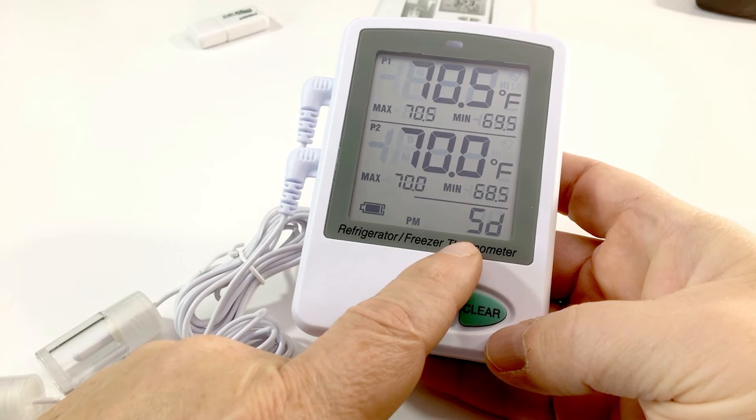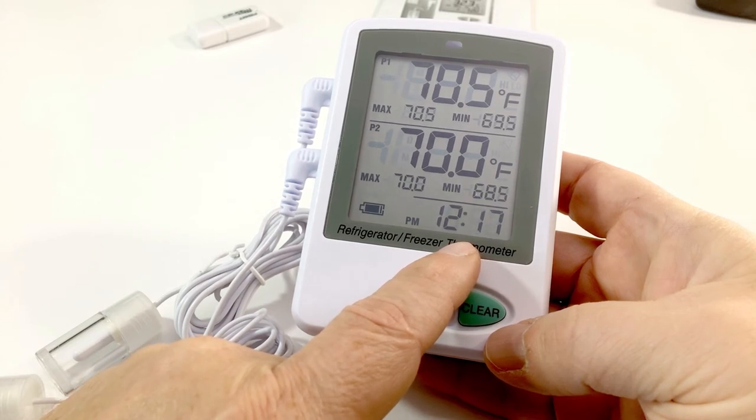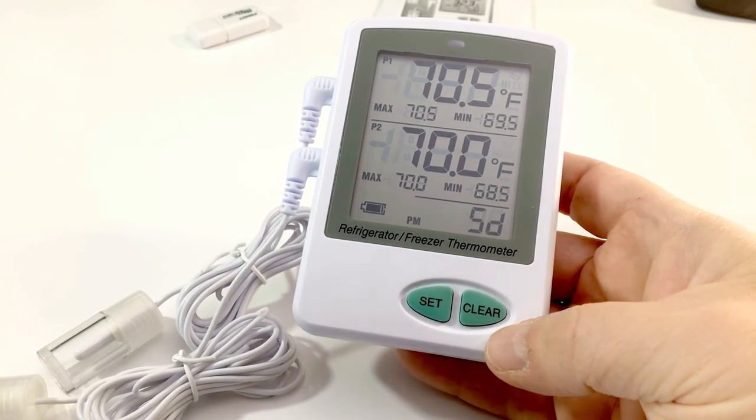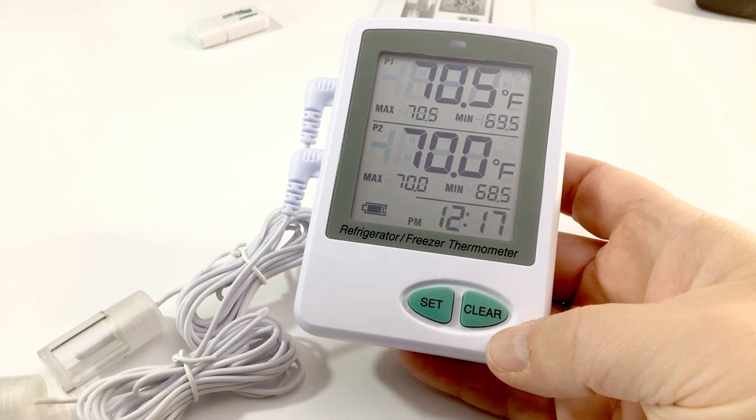To the right of the battery symbol you will see the time and the symbol SD. The SD symbol means the card is installed. If you do not see the SD symbol and only see the time, that means the card is not seated properly or is defective.